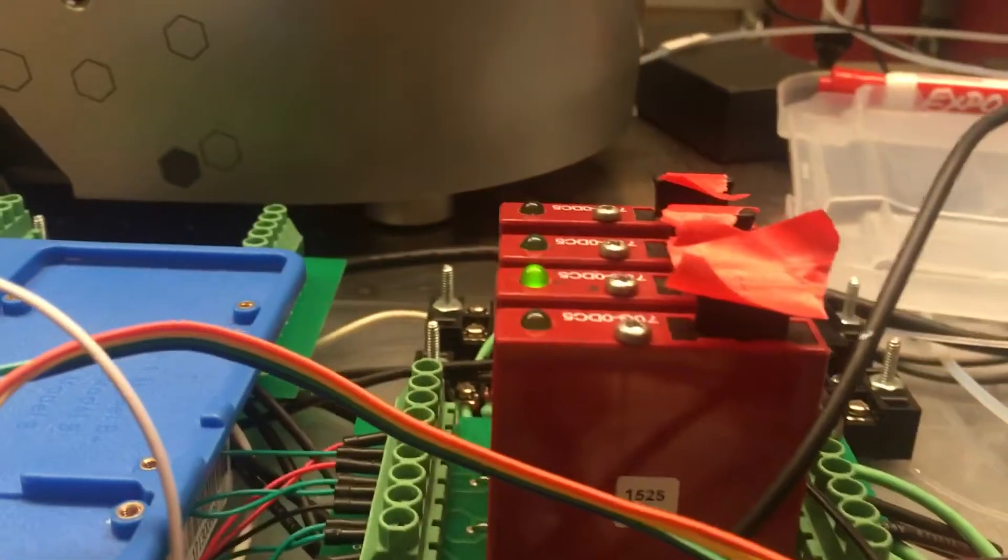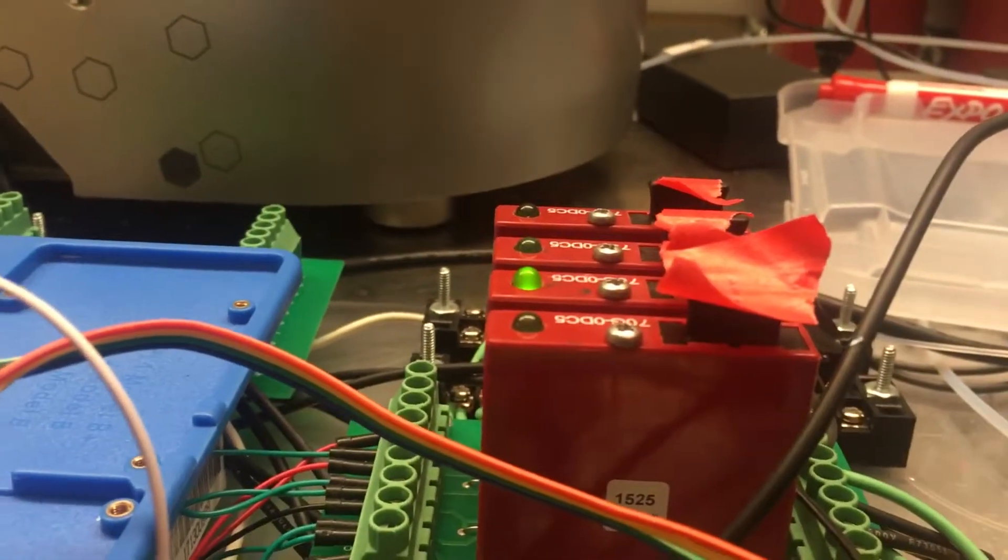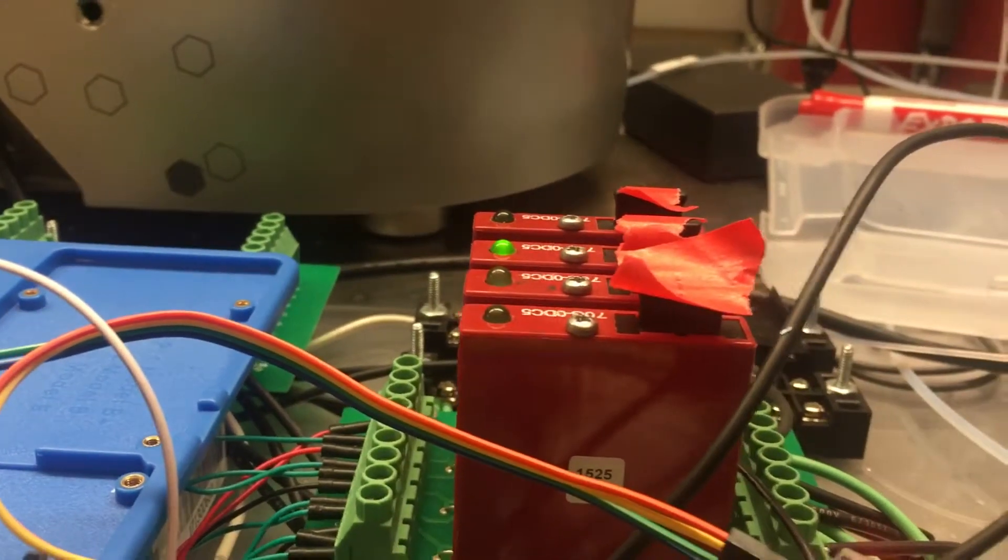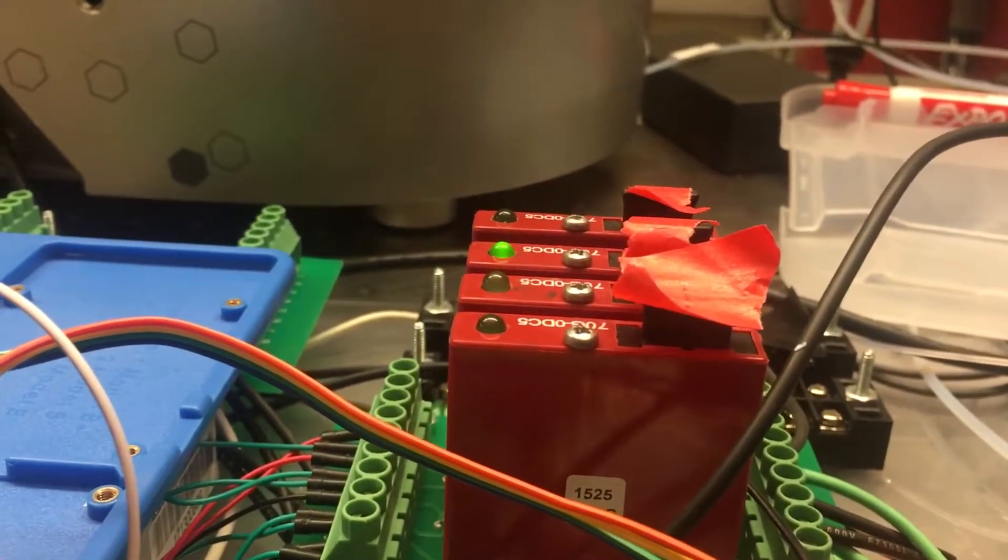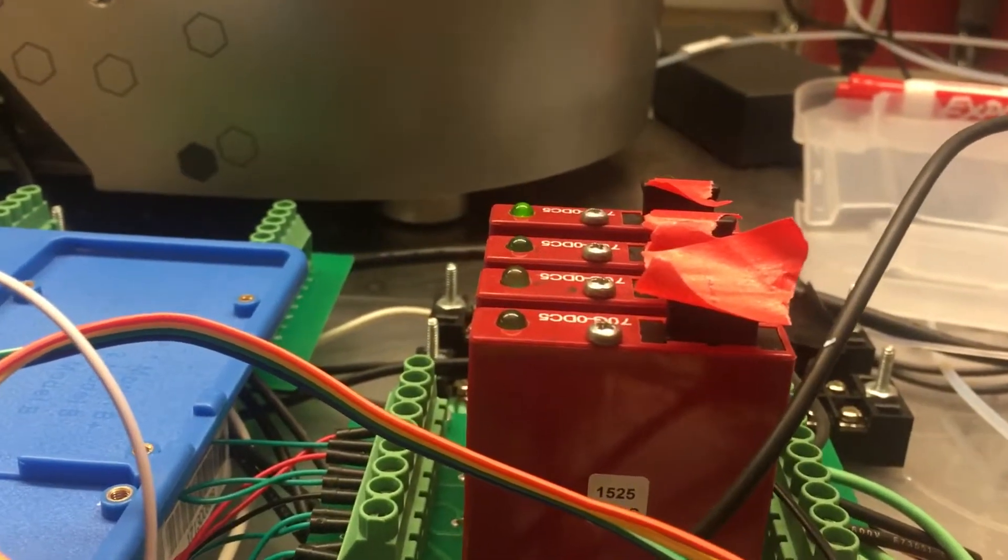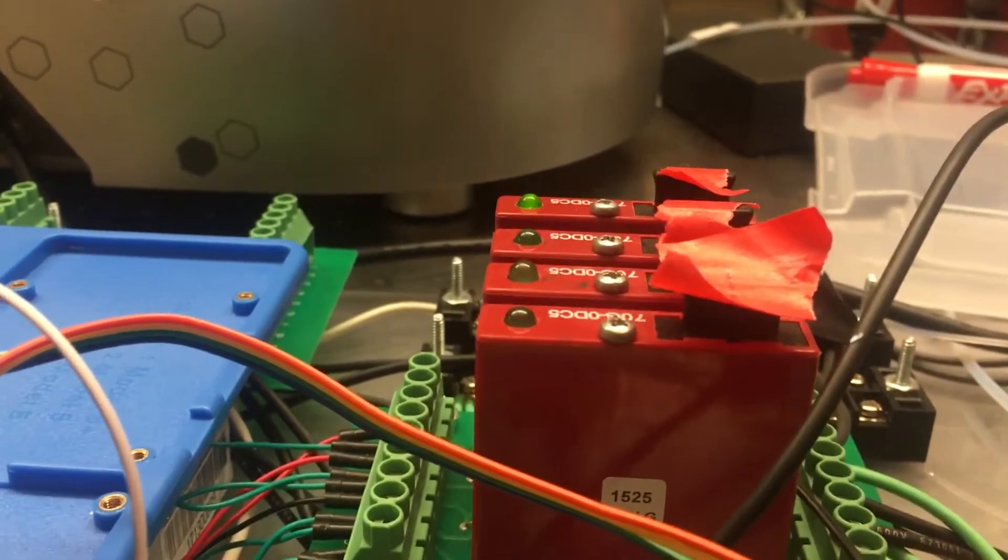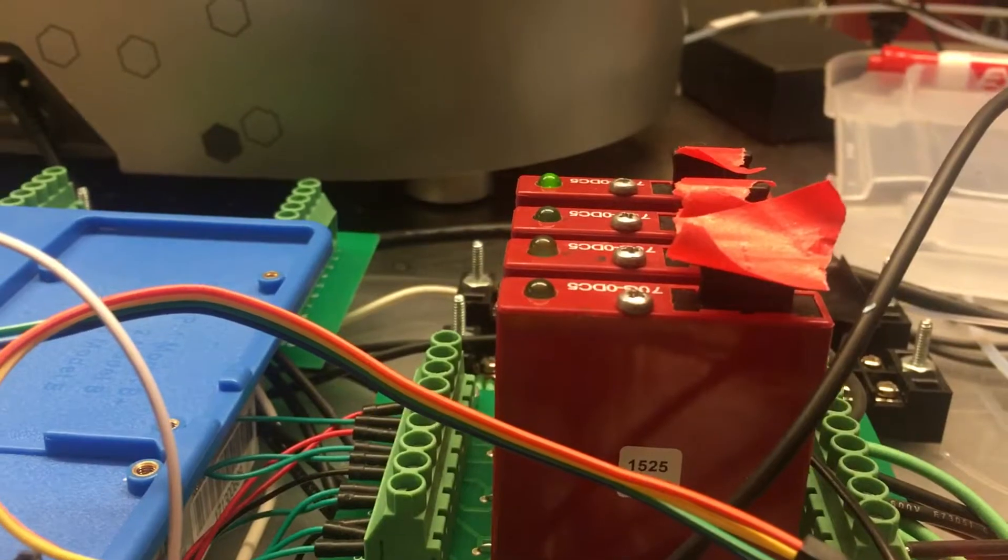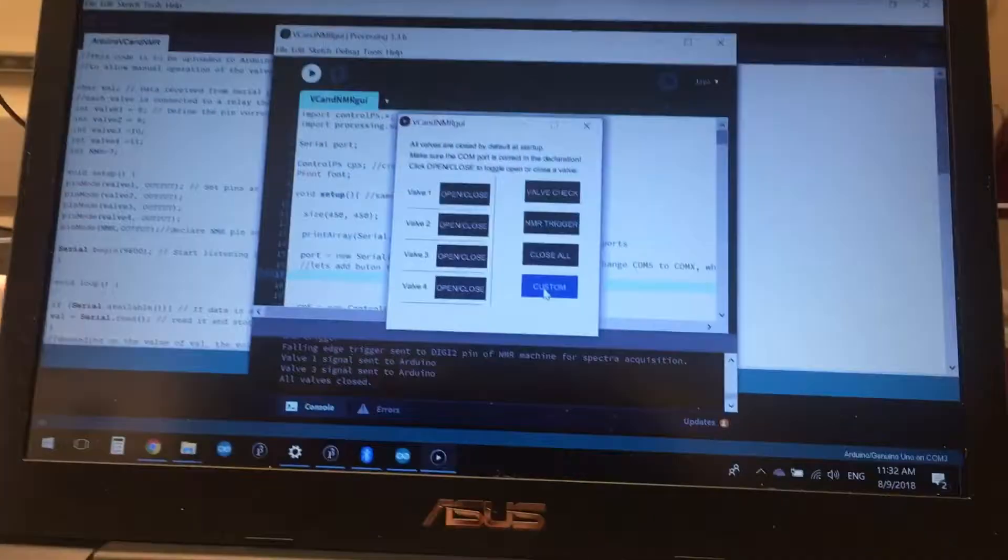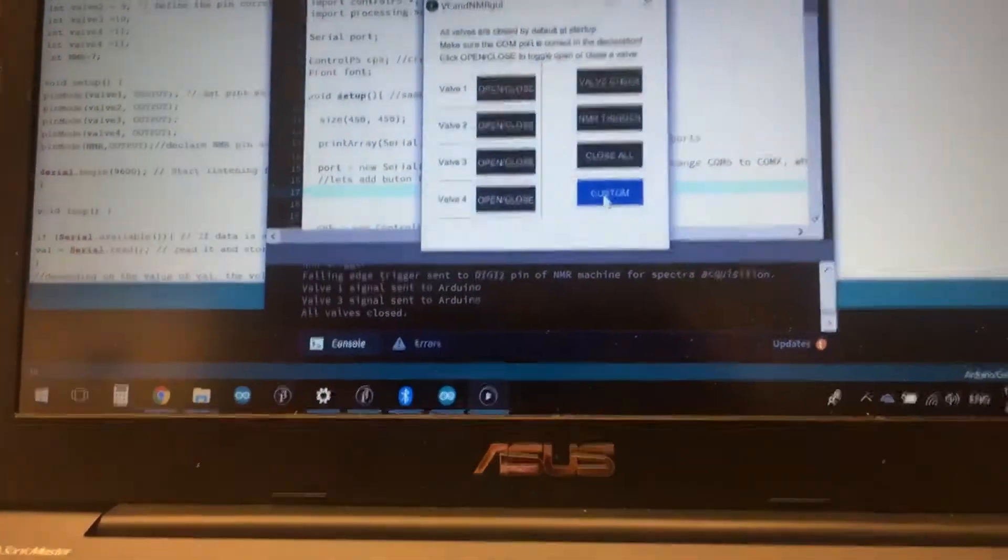So if I click custom now, we'll just note how it's going through some sequence in which it's holding each valve open for a different amount of time and then closing it, and so that's pretty cool stuff.